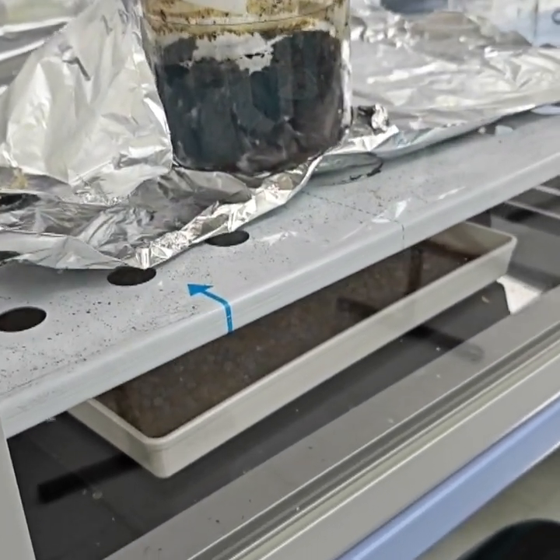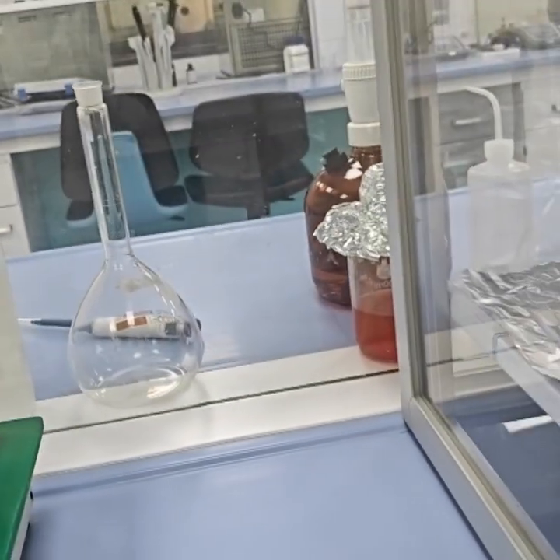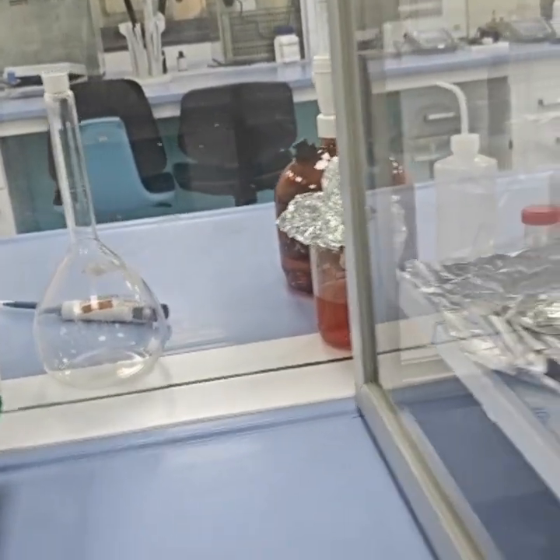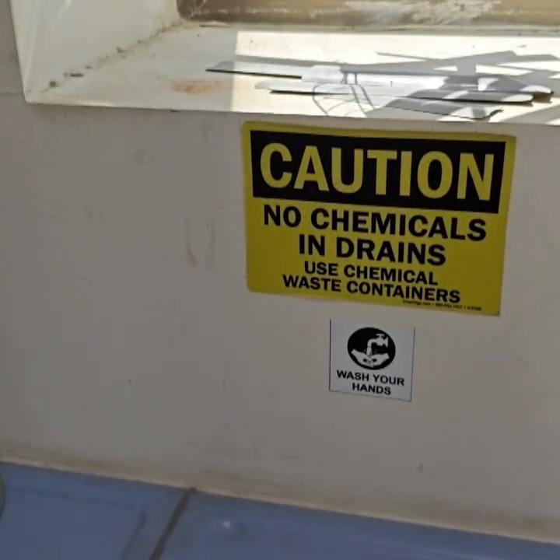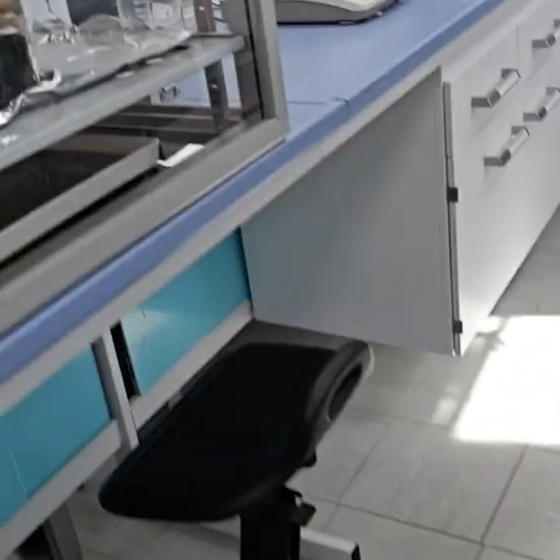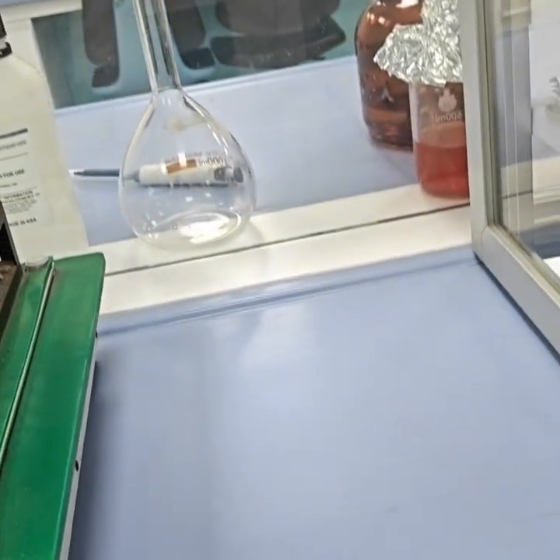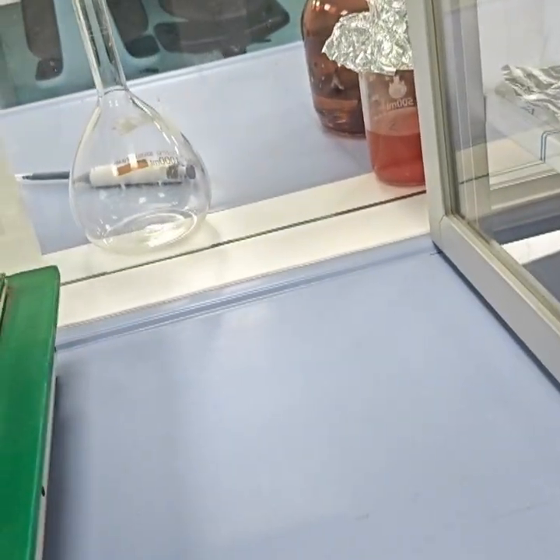And for the waste disposal, if you are using concentrated acids, you must neutralize the acid or bases before drain disposal. If you are putting your waste in here, you can see the caution: no chemicals in drains. Use chemical waste containers. Suppose you are putting the waste, you must neutralize in case of acid or base. Okay, and collect heavy metal waste separately.